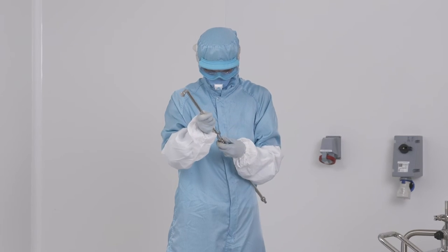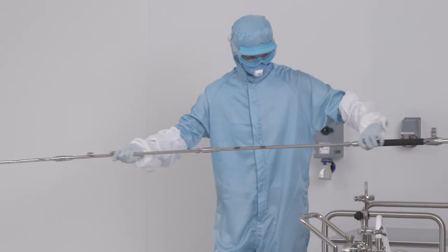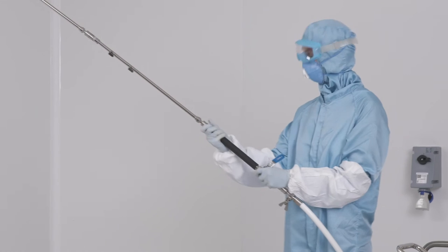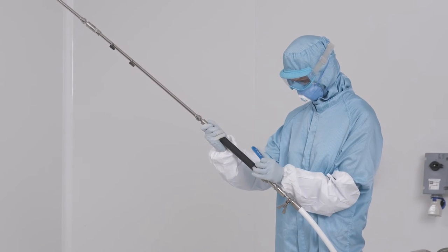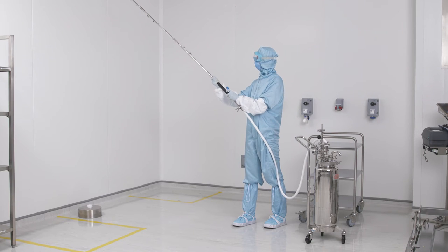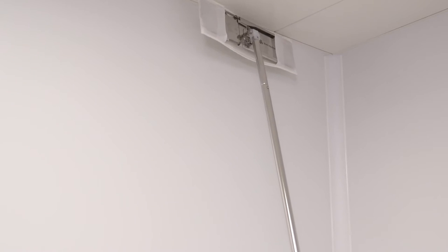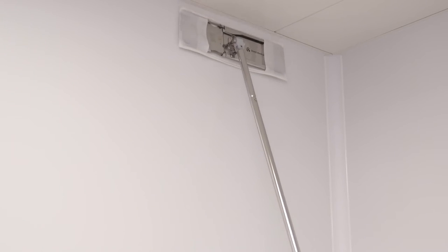The lance extensions are also invaluable in enabling operators to easily apply fluid solutions behind or over machinery. Following the required contact time, wiping can be simply conducted in the appropriate way to ensure mechanical action is applied to remove surface particulate matter.